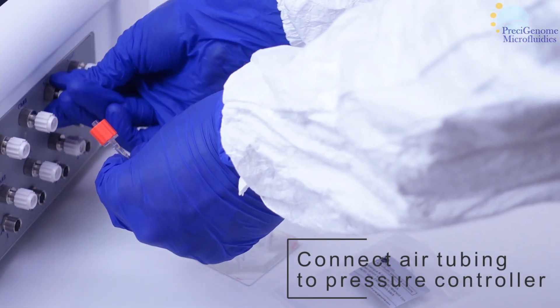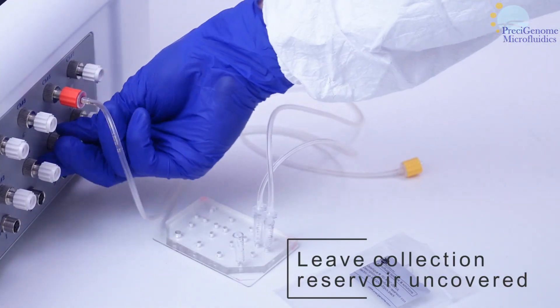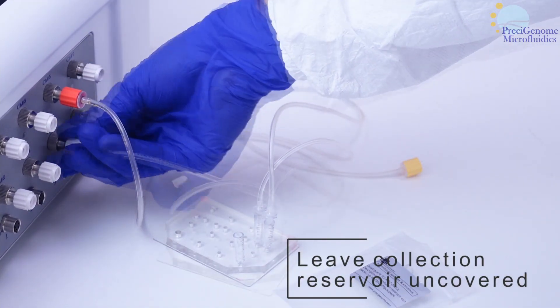Now connect the tubing back to the pressure controller. Leave the collection reservoir uncovered and your setup is complete.